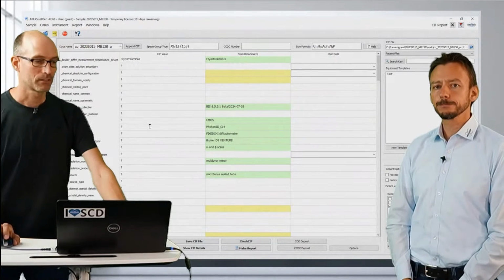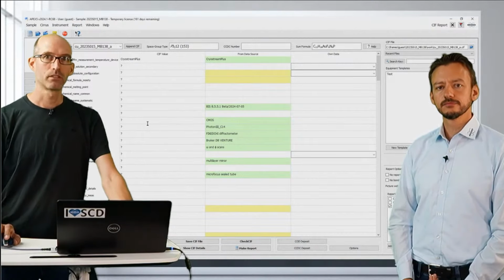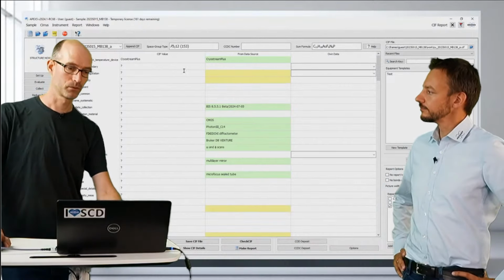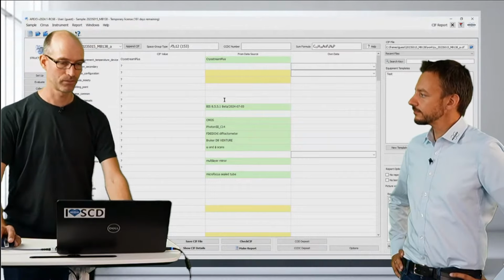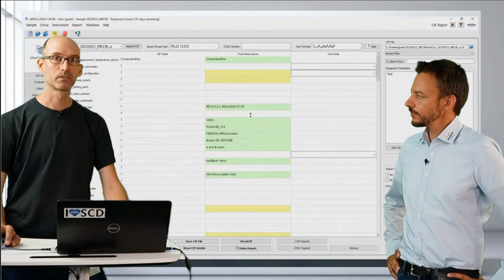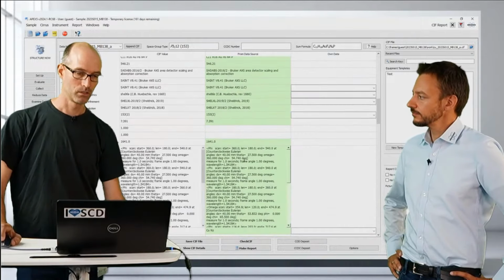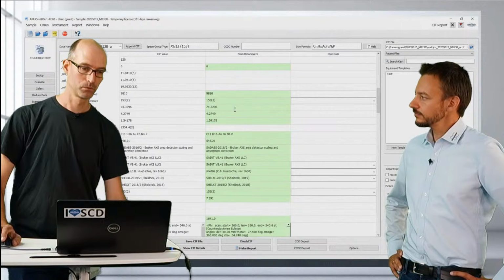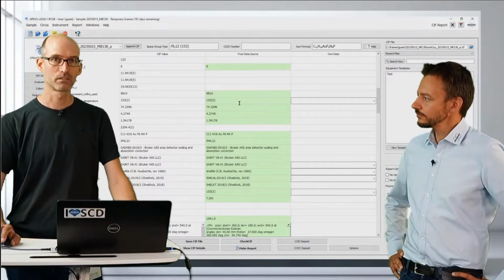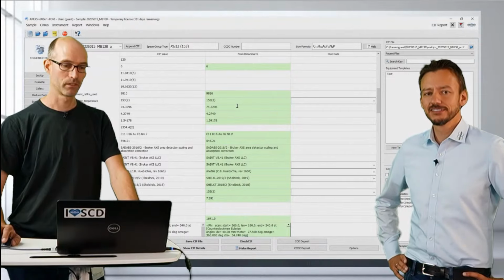Yeah, the nice thing is that Apex collects during the processing of the data lots of information and stores that, and that all will automatically end up in the CIF file. So you don't have to find the version of BIS that was used to measure the frames or the name of the detector or which Saint version was used or so, or the number of reflections that was used to determine the unit cell. That is all automatically put into the CIF file now.